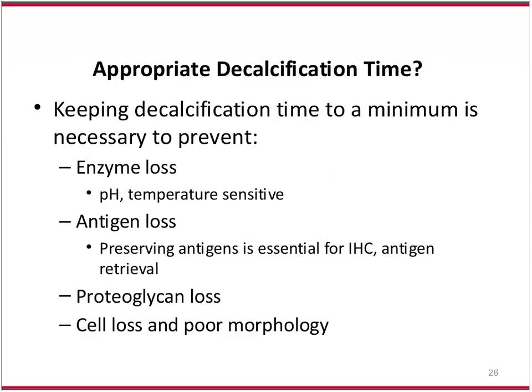So keeping the decalcifying time to a minimum is necessary. It's very important for lots of reasons, because we don't want to have all of our samples sitting in here and people waiting and waiting for them. But we also know that the longer a sample sits in a solution, the enzymes will die. They're pH and temperature sensitive. Antigen loss. Preserving antigens is essential for immunohistochemistry and antigen retrieval.